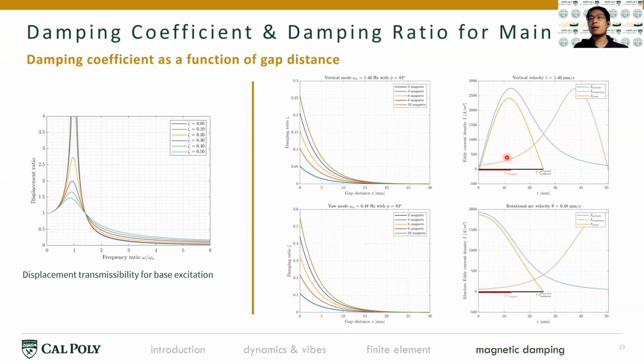Notice here that there's a couple of assumptions that we need to make. Specifically, you need to put the magnets pretty much far away from the edge of the copper, because otherwise it will mess up the calculation. And we have to use a method here called the imaginary current density, because you see that at the very edge of the material, it doesn't go to 0. And that's actually a wrong assumption.